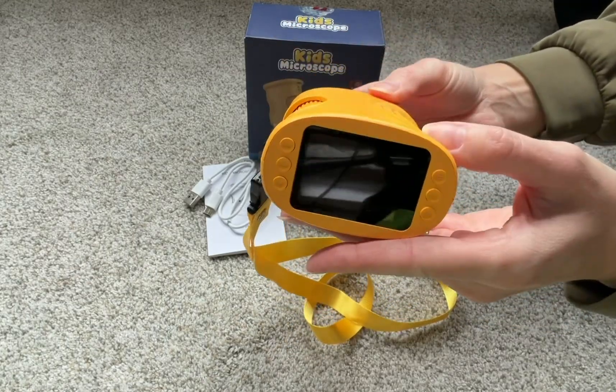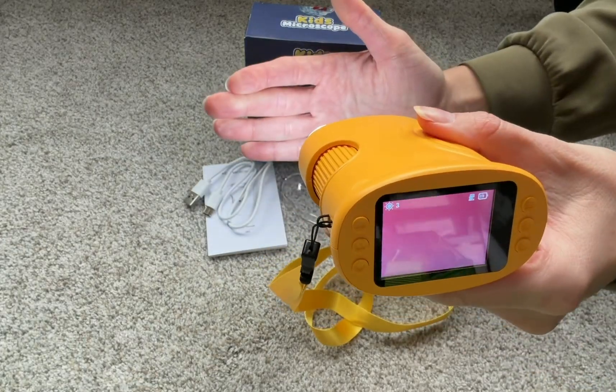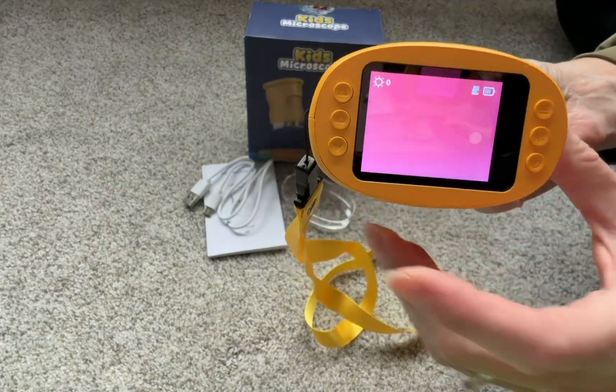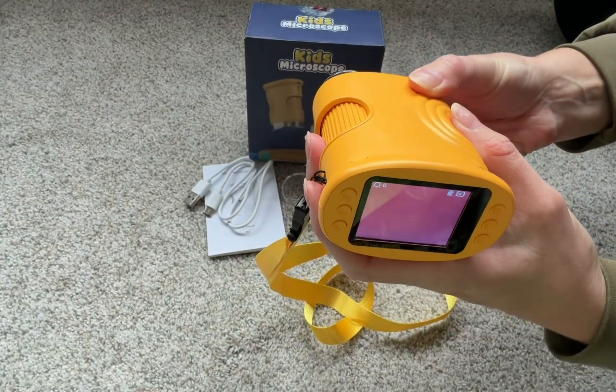This is the HD camera screen. The bottom button will turn it on, and it also starts with a light. If you don't want the light on, you just press the light button over here. There is also a camera button to take photos and video.